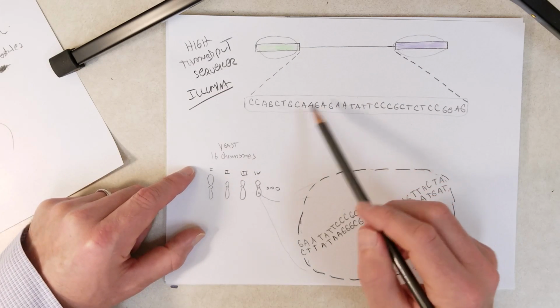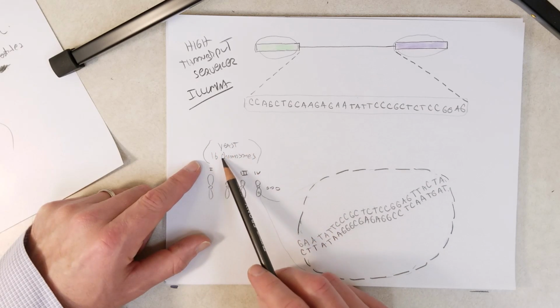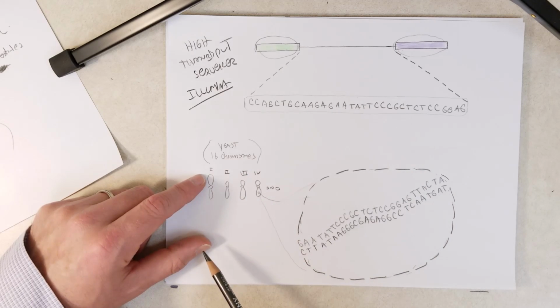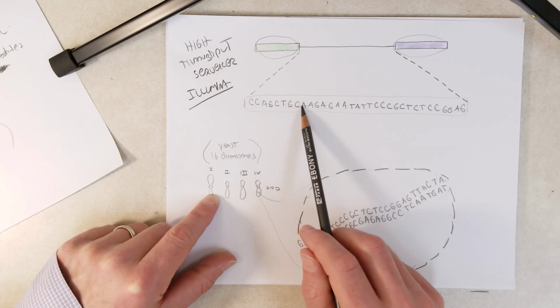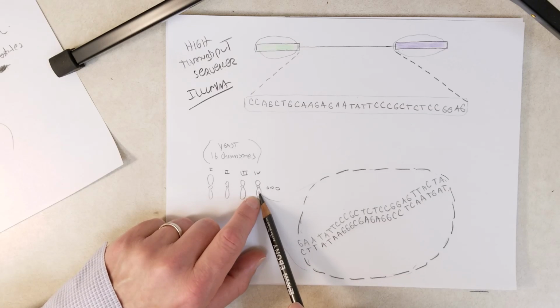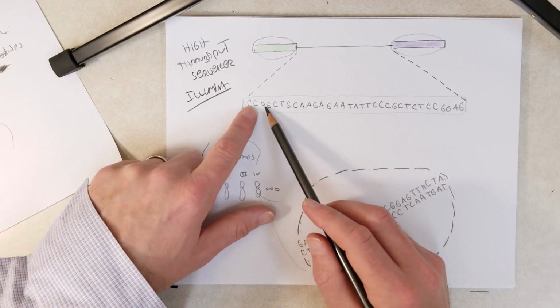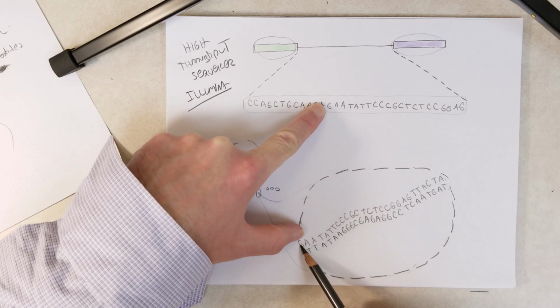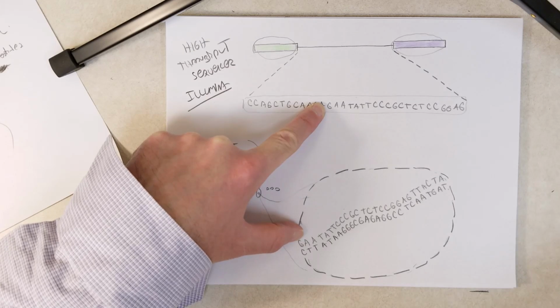So at this point, because we're working with yeast, what we would do is go to the yeast genome sequence. And yeast has 16 chromosomes, and as an example, I diagrammed 4 different random chromosomes here. We would search the yeast genome sequence for this sequence right here. Let's say we found this on chromosome 4. And so I'm zooming in to this little section of chromosome 4, and I'm looking at the DNA sequence here. I don't think I diagrammed the whole thing, but let's see, G-A-A-T-A-T-T. Okay, so I found it starting right here.